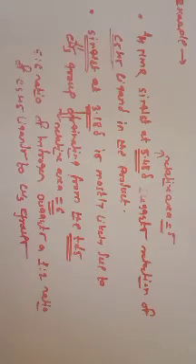So 5 means all these 5 protons are equivalent in this eta 5 C5H5, so we get a singlet. And we get another singlet at 3.18 delta, but its relative area is 6. That indicates a total of 6 protons, meaning 2 methyl groups should be present in the product, originating from the TDS. So this much information we obtain from the H1 NMR data.